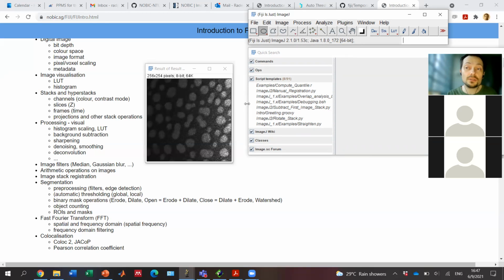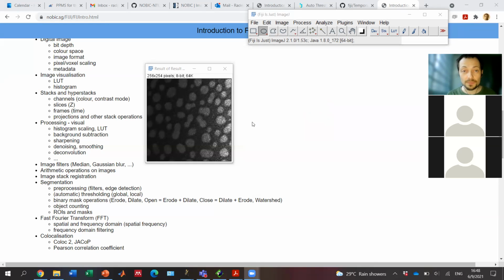Is it lower than the threshold? And I didn't care about the surroundings of the pixel. If I want to utilize the 3D information, I have to look into using the surroundings. I will get to this now in a short while, because it's quite important. It's a very good question.